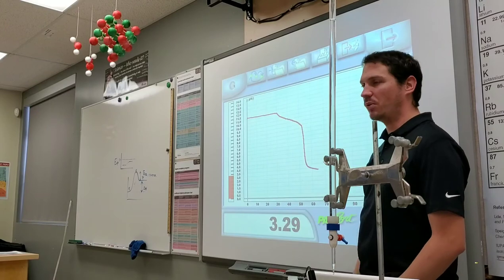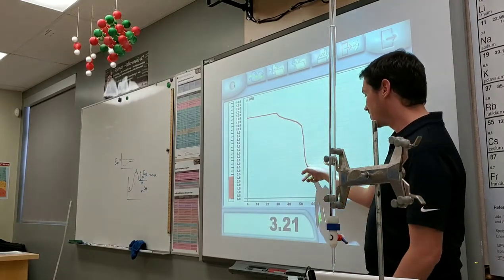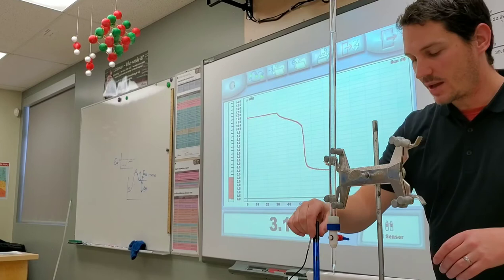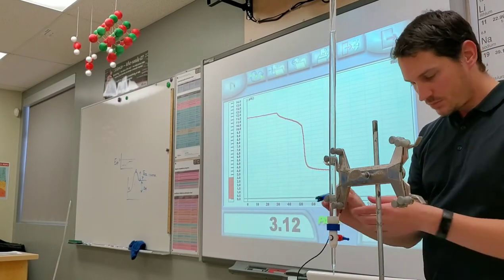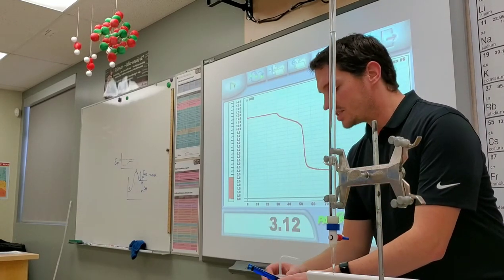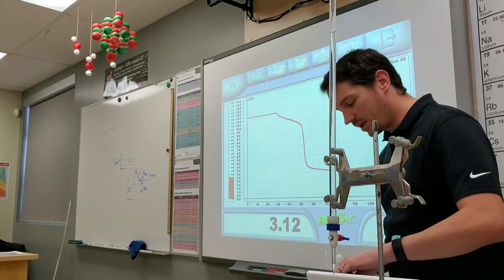After the equivalence point, we've run out of base to react with. Would you agree? Yes. So now we're adding more and more acid, right? And yes, absolutely, my pH just can't get any lower than this. So there are some things that I want to bring your attention to, and I should have done this before.